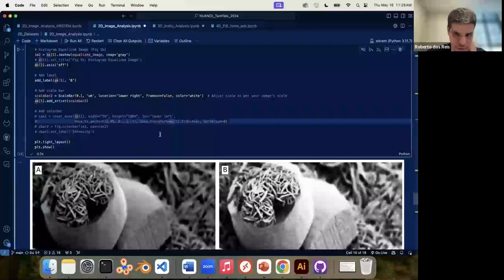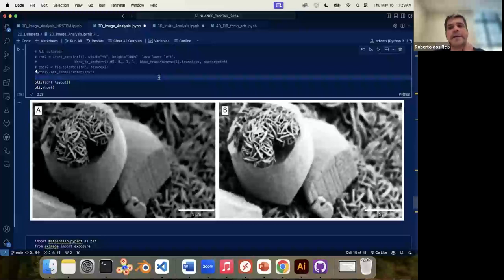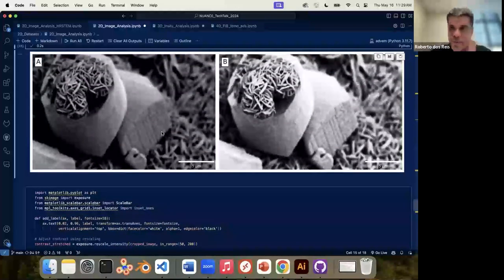Oh, sorry, this is the one here. Sorry. Yeah, this guy here. So this, for example, would be good, right? It has the labels, it has the scale bar, you apply some filters, some intensity equalization or the contrast stretch. Perhaps here you might want to plot with a slightly different range just to avoid this bright area here, but more or less good for submission, right?